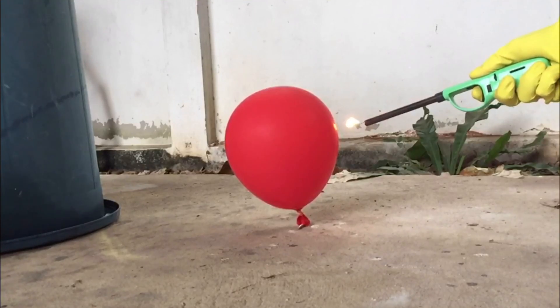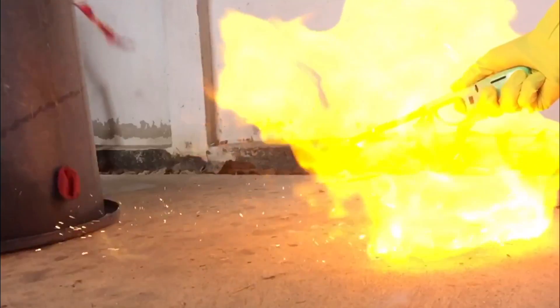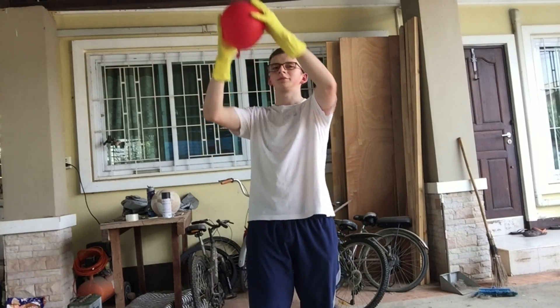In today's video I'm going to show you how you can make clean burning hydrogen gas from hydrochloric acid and aluminum. Hydrochloric acid is extremely dangerous and you should never use it unless you're going to follow the safety guidelines that I give you.